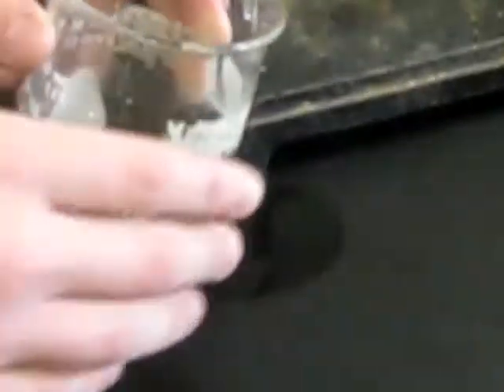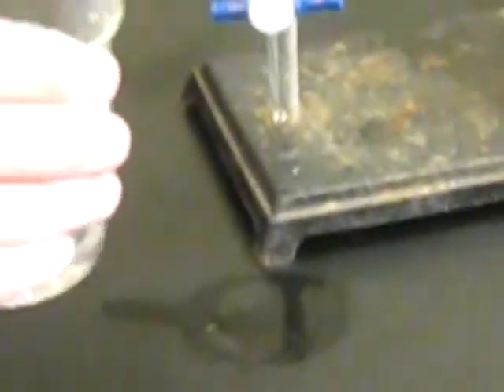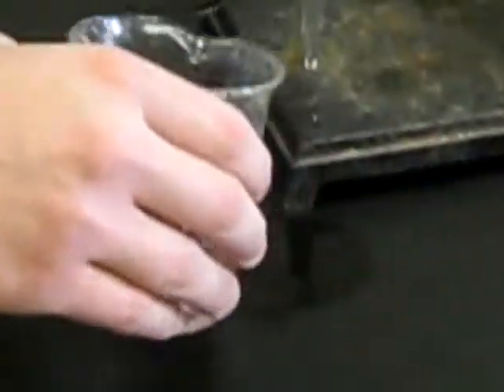What we're going to see here is that the acid should start to turn a light purple and then become darker as you add base, but you don't want it to become too dark, otherwise you've gone too far. The pink color will fade as he swirls, but eventually that pink color will start to hang around and it'll get deeper. Once that starts to happen, we add 1 drop of base at a time until we get the color just right.